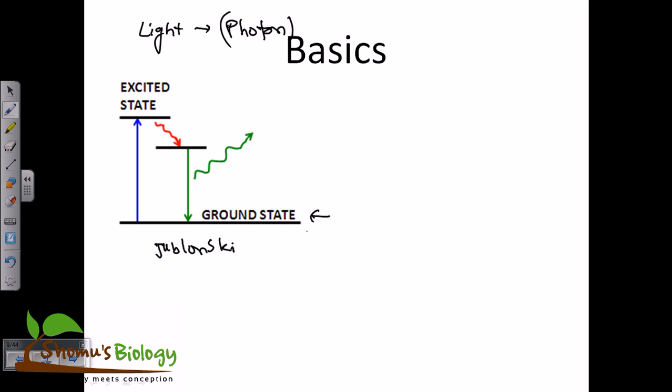So it has a ground state level, which is the basic level, and from this ground state, if we add some energy from outside, if you put some photon or energy from outside, that photon excites the electron present here to the excited state, the higher state. For example, it is the S0 state, then we have S1, S2, and different energy states for the electron. So that electron will be kicked onto the higher energy state, called the excited state, right? This requires energy, and that energy is brought by the light source, or the photon hitting here.